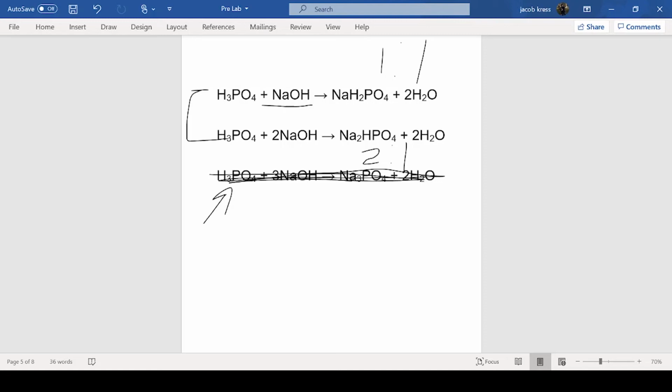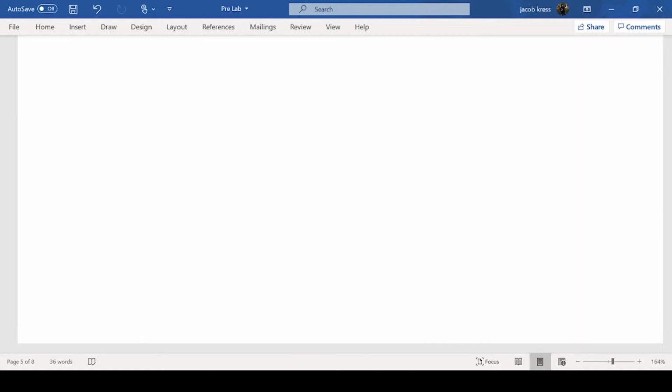And that's what the calculations you guys are going to do from the data that I'm going to give you is going to determine. The very last part of this experiment, part C, is about determining the mass percent of acetic acid in vinegar. If you guys remember from the second to last experiment we did, when we had the glacial acetic acid that we used to turn the light bulb on, I told some of you guys that most of you have been in contact with some form of acetic acid at some point in your life, and that's because acetic acid is found in vinegar.